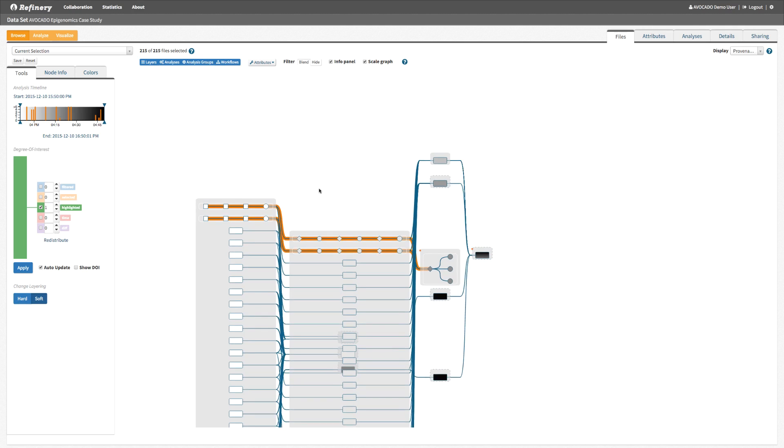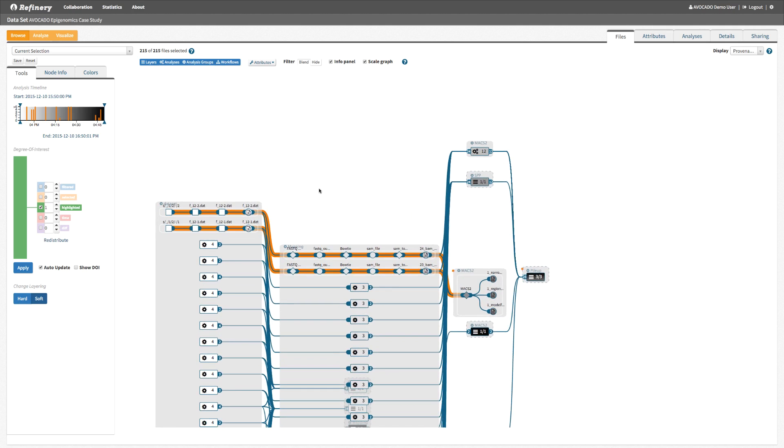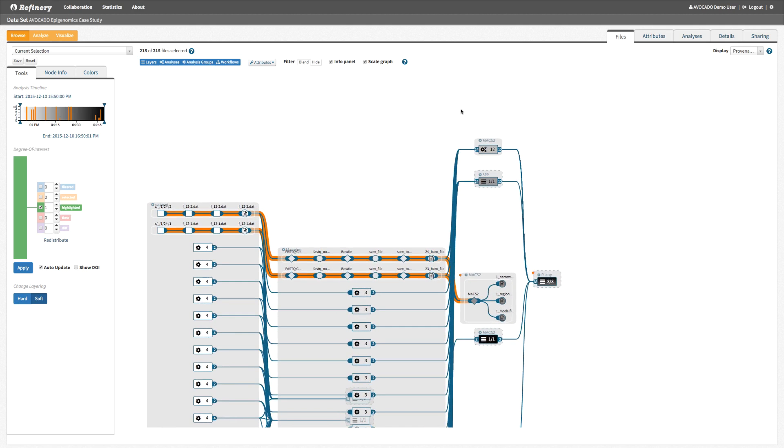We zoom in to investigate intermediate files and tools on the path from the raw data to our workflow of interest.